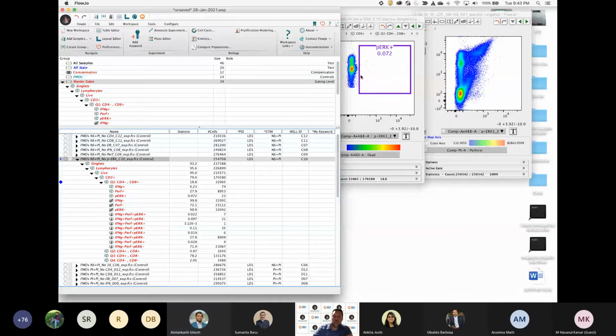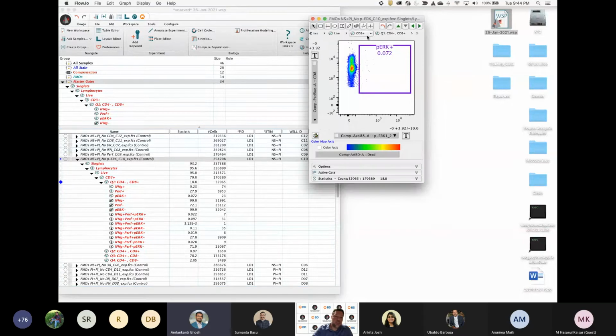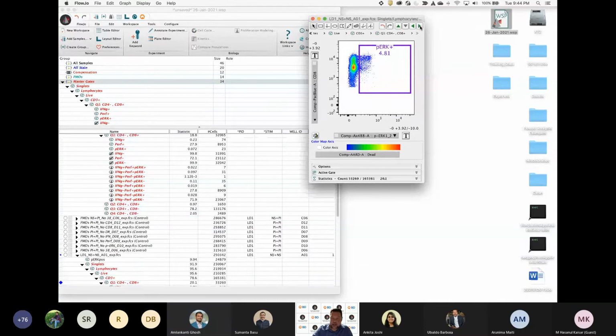But when you have something that is dim, or has a continuous streaky expression pattern, like a secondary or tertiary antigen that is a very low level expression, one thing that you can consider doing is running an FMO control and leaving just that one reagent out. And that way, when you gate down to your population of interest and look at that distribution, see where the true negative is, and then when you add the antibody, you can see the expression pattern appear, right? The difference there.